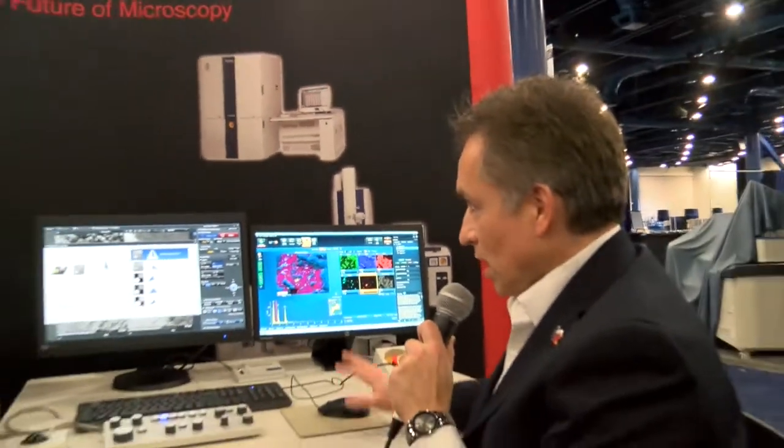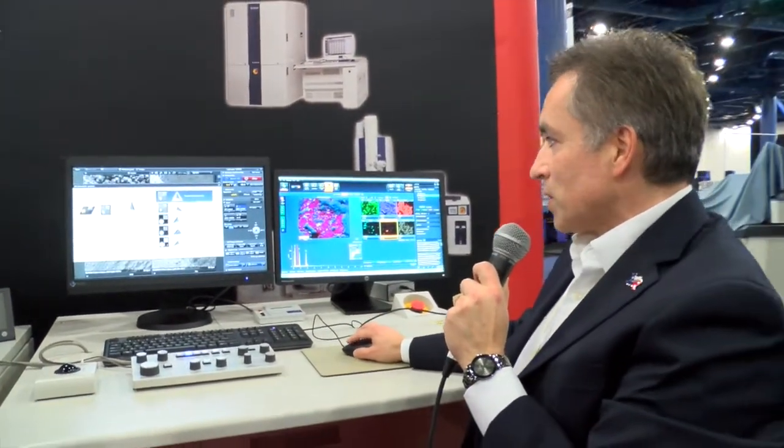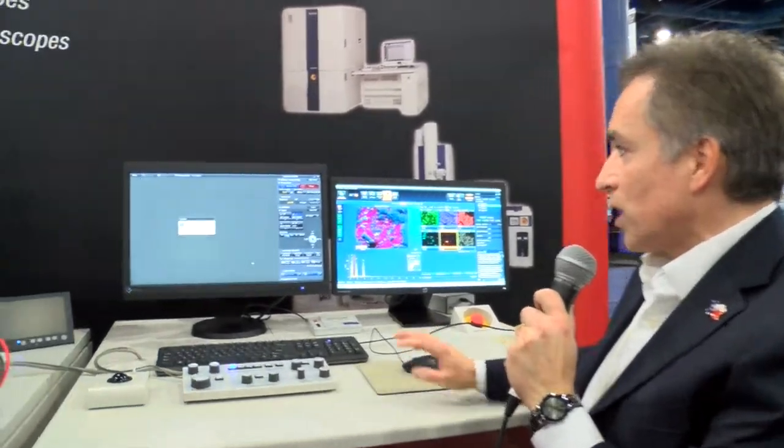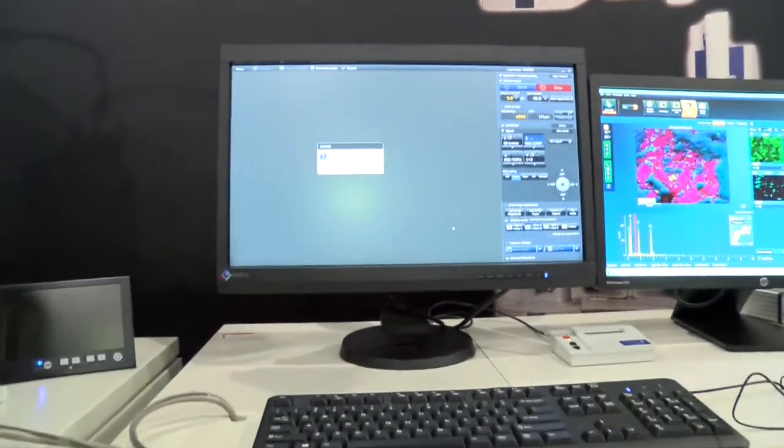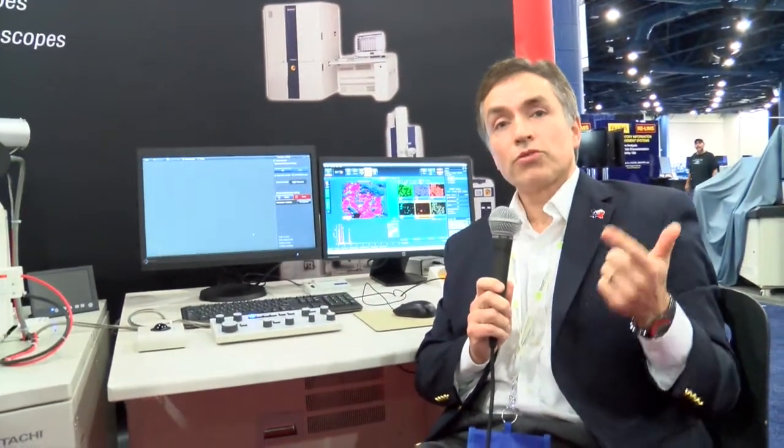This software actually allows a very inexperienced or novice user to take full advantage of the microscope's performance. Instead of having to figure out what to do and how to do it, the system will automatically do it for them. For instance, I'm going to select elemental and surface information imaging. As soon as I click that and click change, the microscope immediately goes into realignment mode, setting all the voltages and all the lenses to the proper condition to achieve the selected imaging objective.